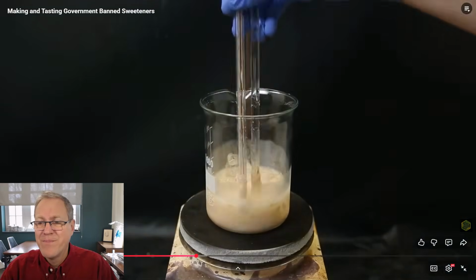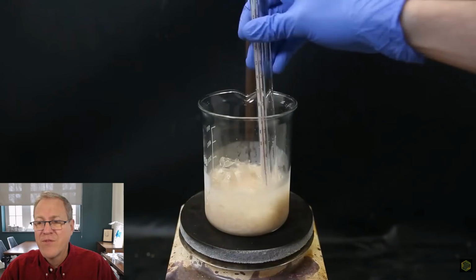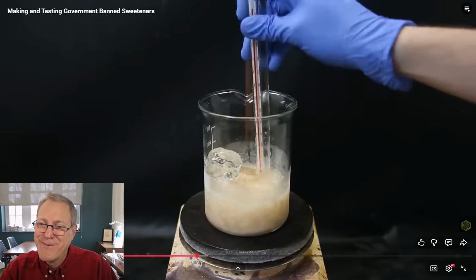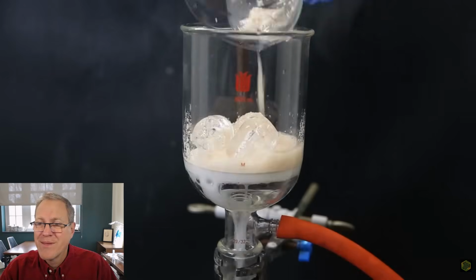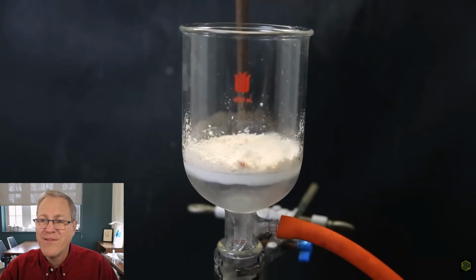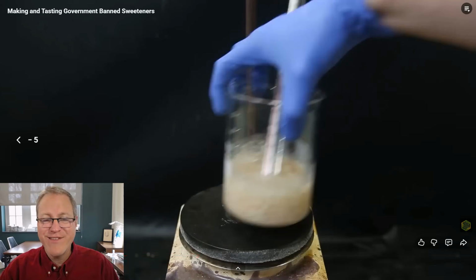To force all of the product to precipitate. So the product is not water soluble. It precipitates, and now he's got this ice slushy. When it is done, I set it up for vacuum filtration to filter out the product. I remove the remaining ice. So you've got to remove that ice. Let's go back. Let's see those cubes come out.